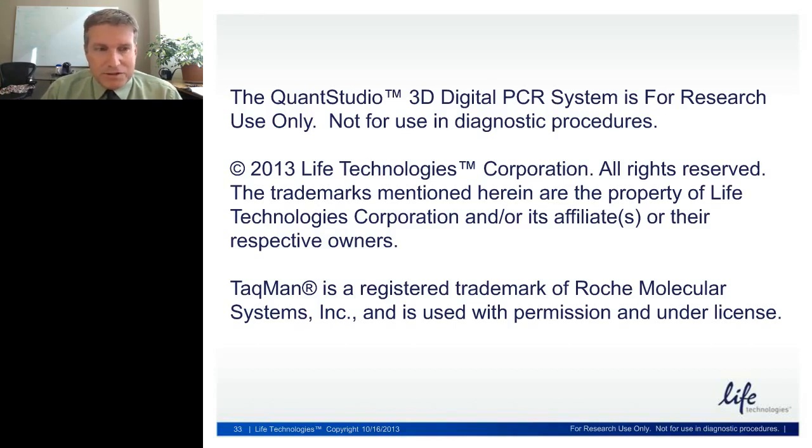Our research and development team is always trying to find new ways to improve our system, and to apply new chemistries to increase sensitivity and throughput. I would have to say on our particular system, I'm not sure a molecular beacon would be detectable, because the reader is designed to detect only VIC and FAM dyes, and I'm not sure how a particular beacon would be detectable in the spectrum that the VIC and FAM dyes are designed to quantify.